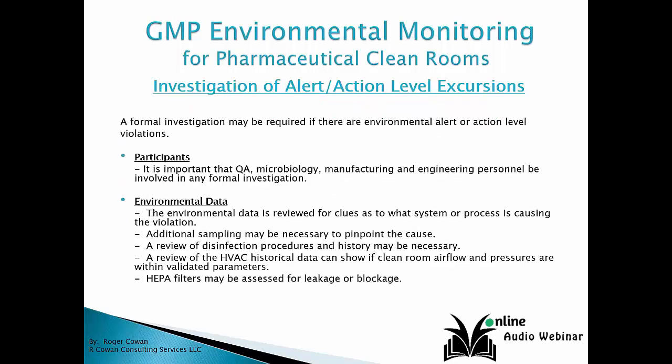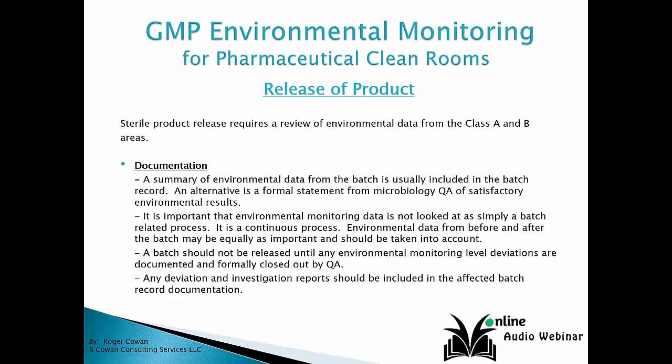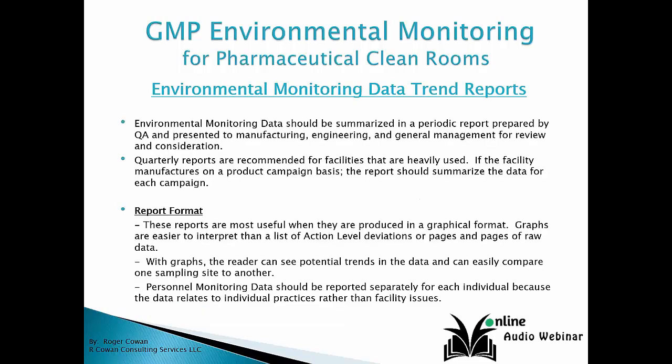Investigation of alert and action level excursions. Microbial identification. How does this all relate to release of product? The release does require a review of the environmental data. Now, documentation. A summary of environmental data from the batch is usually included in the batch record. The environmental monitoring data should be summarized in trend reports. This data is summarized in a periodic report prepared by QA, presented to manufacturing, engineering, and general management.